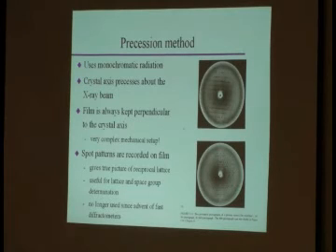So, you could actually figure out what the lattice was like, what the crystal system was. In some cases you could look at systematic absences, figure out space groups. Okay? It was a big step forward. Of course, with modern diffractometers, once again, we really don't need that. But that was the historical development.